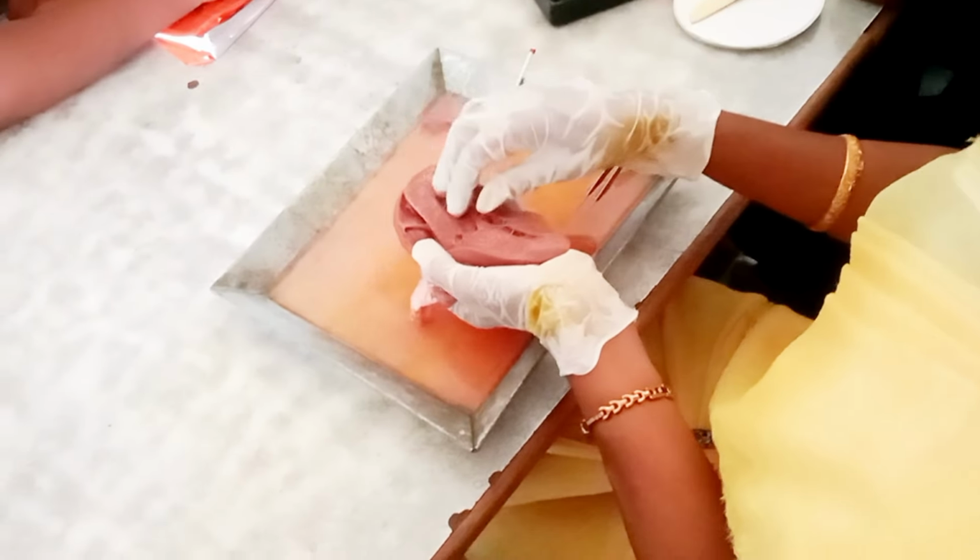You can see how thick these ventricle walls are. These are known as chordae tendineae, which are filament-like structures which connect the leaflets of the heart valves to the wall muscles of the heart, preventing leaflet prolapse.